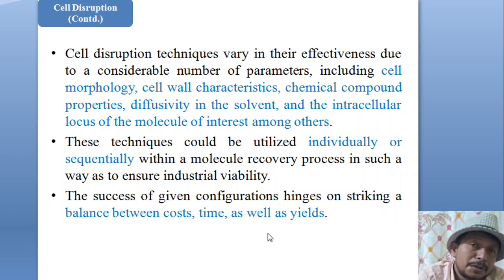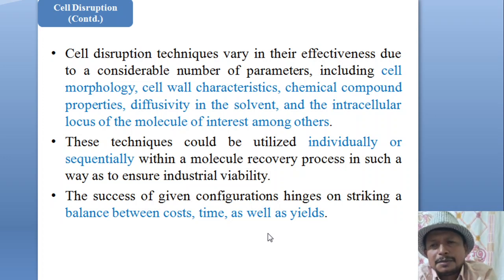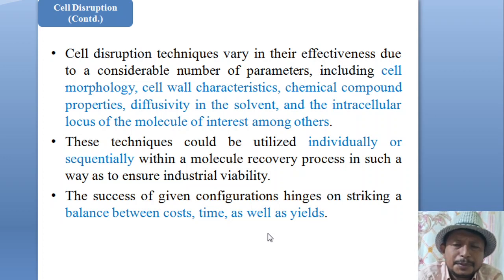If you are using a mortar and pestle, that means hardly it will cost minimum rupees. We can buy a mortar and pestle, right? Then again, time we have already discussed. We have to complete the cell disruption methods within a very short time frame.